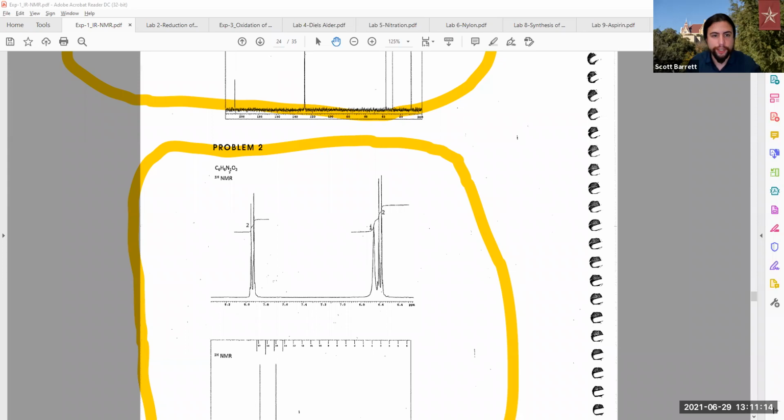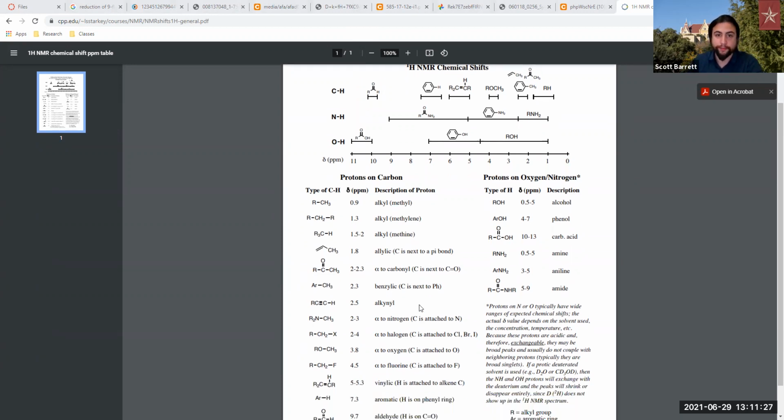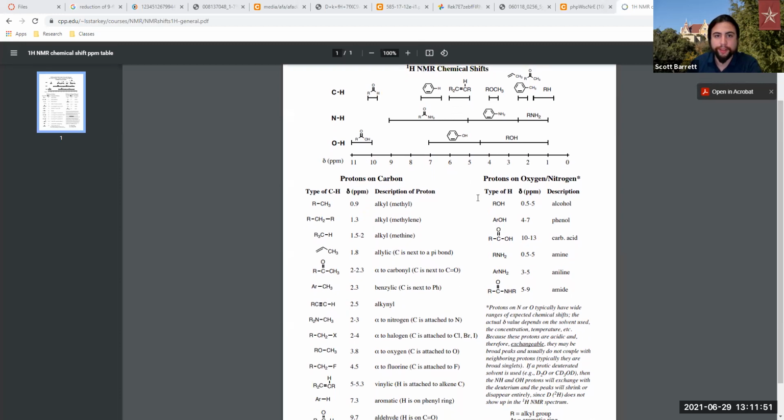Okay, I'm going to share this table here. On this table, you can utilize any common IR, proton NMR chemical shift sheet, but this is a good sheet because it describes the locations of the common groups. This is the most important part of NMR: understanding the location of the groups, the quantities, and the adjacent carbon-bound hydrogens, so that you can know whether you have a singlet, doublet, triplet, or multiplet. The primary thing to take from here is to remember the big noted things, okay?